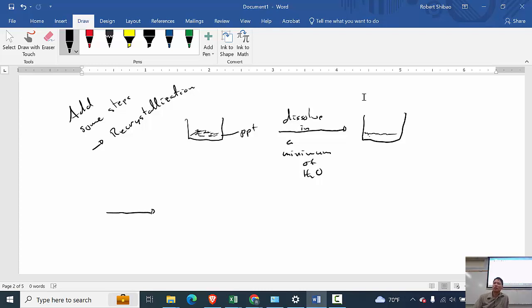By doing this step, we're further getting rid of any kind of contaminants that might have made it through in there. And so how do we reprecipitate it out? The way we reprecipitate it is we add the ethanol plus ice bath.